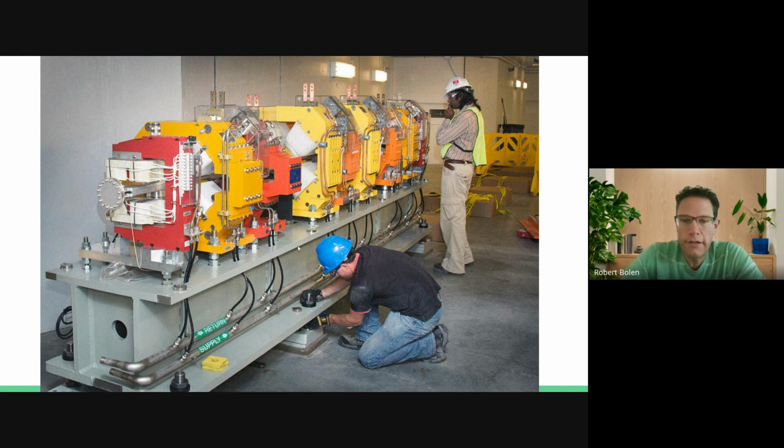They sit on these giant steel girders that keep them stabilized with shock absorbers on them because we can't have them vibrate. You can actually detect the vibration from the crashing of the waves on the South Shore on Smith Point and Robert Moses and Cupsogue. That can actually be detected in the floor of the facility. And so they have it sitting on these dampers and shock absorbers that minimize any movement.